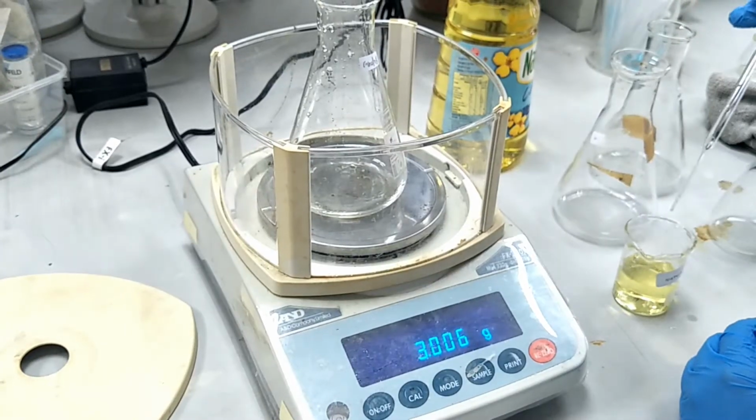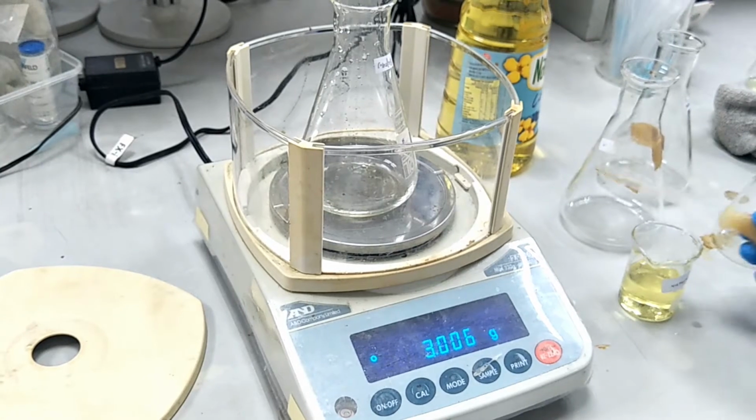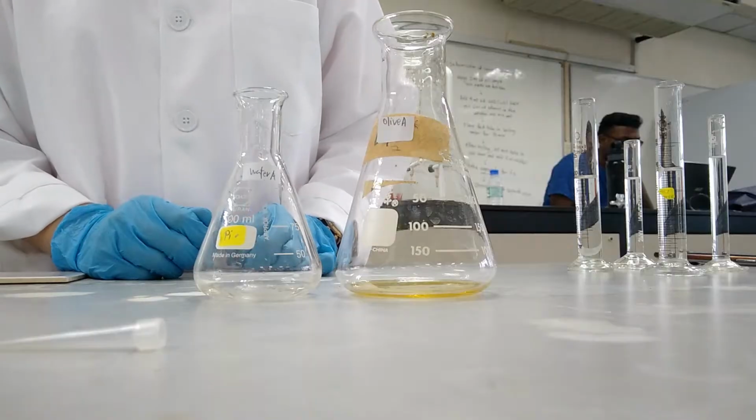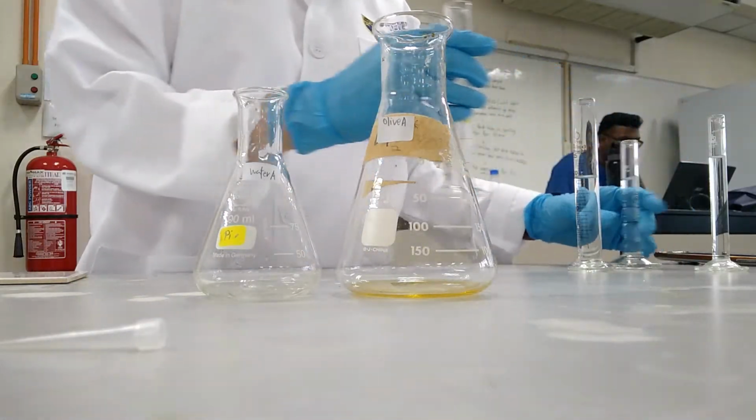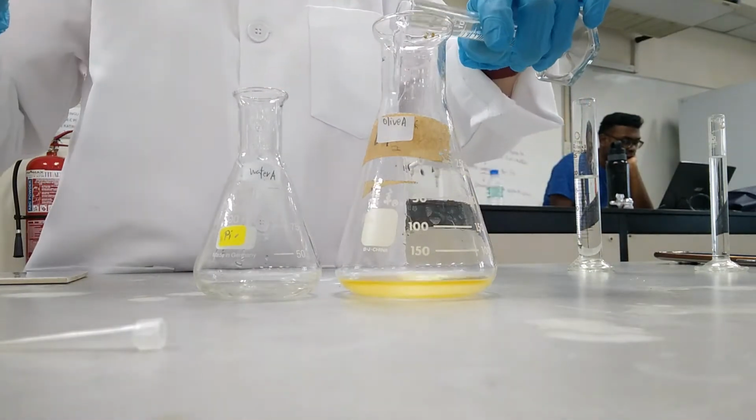So let's get started. First of all, 3 grams of oil sample was weighed into a conical flask. 30 ml of ethanol was added into the sample and then shaken well to dissolve the sample.